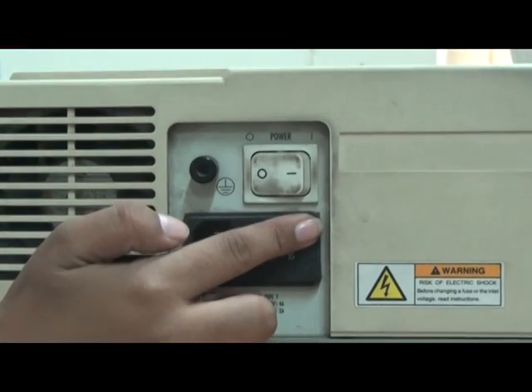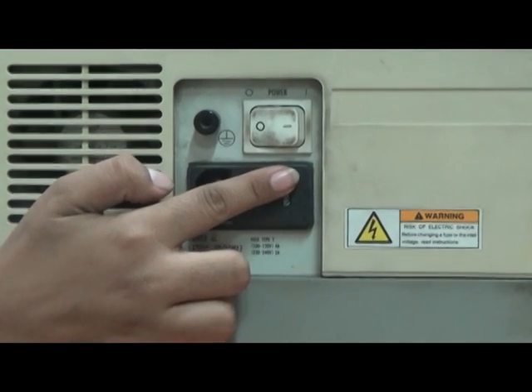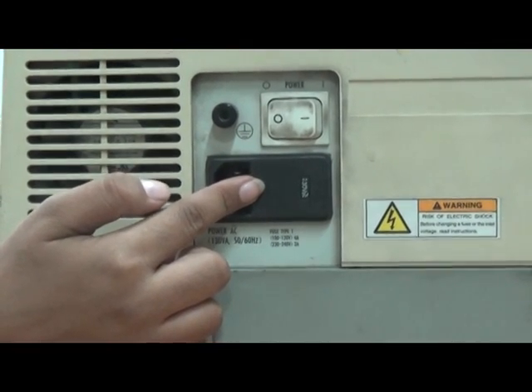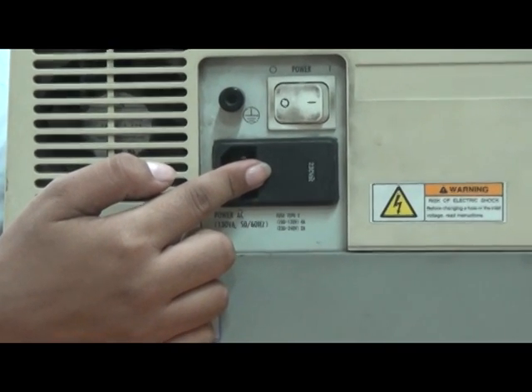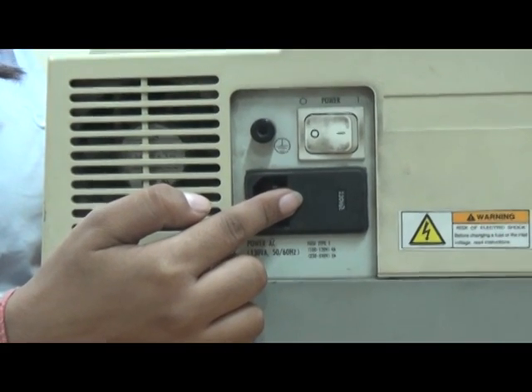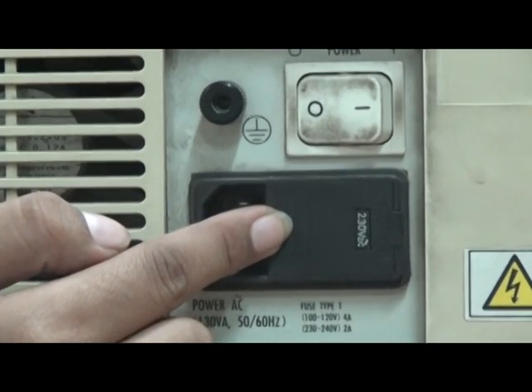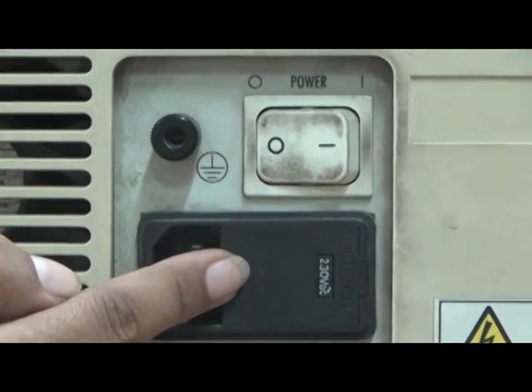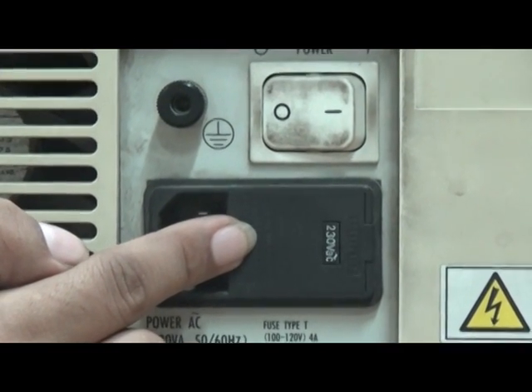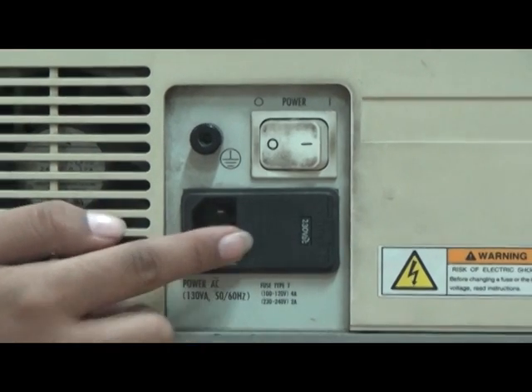This is called the voltage selector or fuse holder. You can switch this between 4 levels: AC 100, 120, 220, 240 or AC 100, 120, 230, 240 according to the input power. Use two 4.0 ampere fuses for the 100 or 120 volt range, and two 2.0 ampere fuses for the 220, 230, 240 volt range.